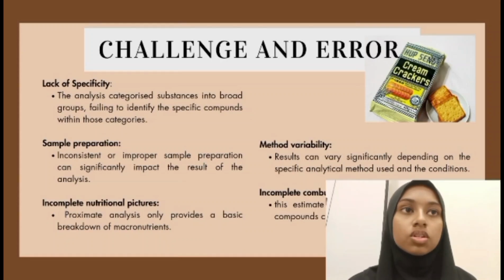It also supports research and product development by providing baseline data to compare samples, improve methods, and enhance product performance. Lastly, it ensures regulatory compliance, helping food producers meet labeling laws and quality control standards set by food authorities.